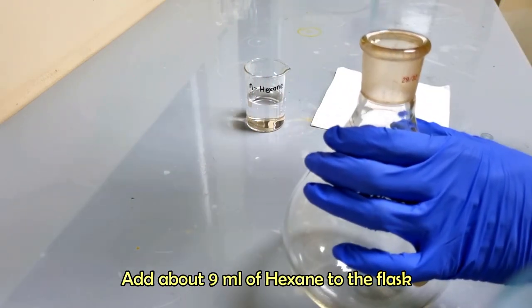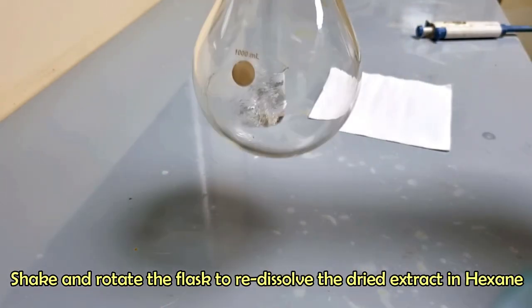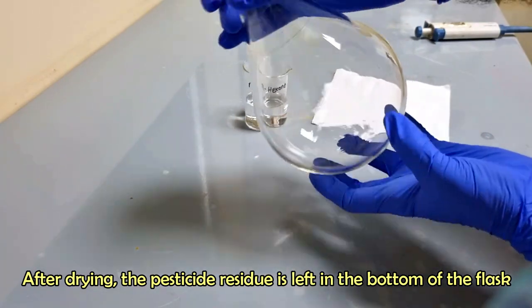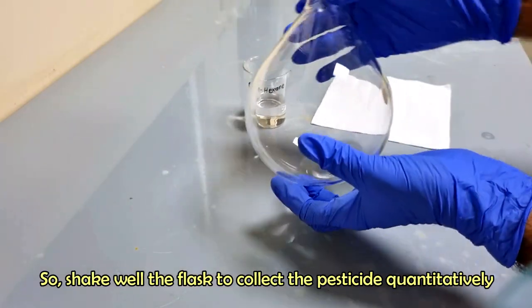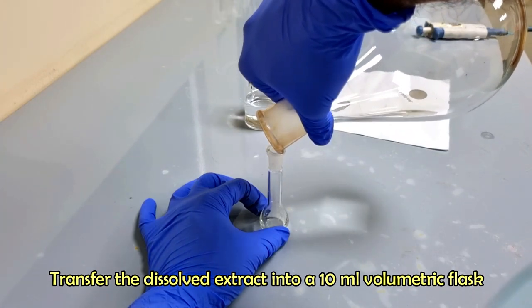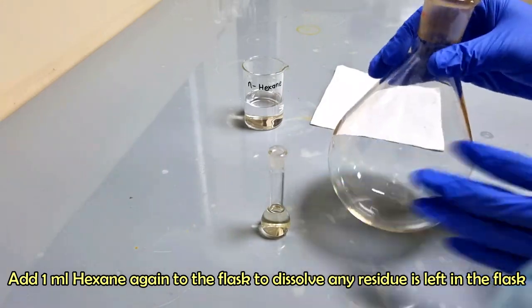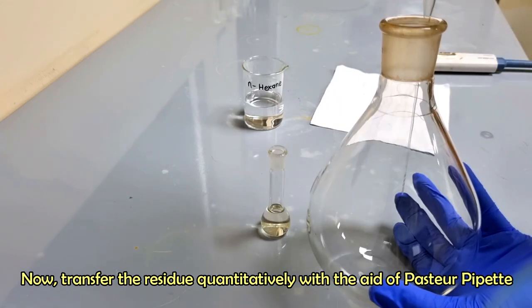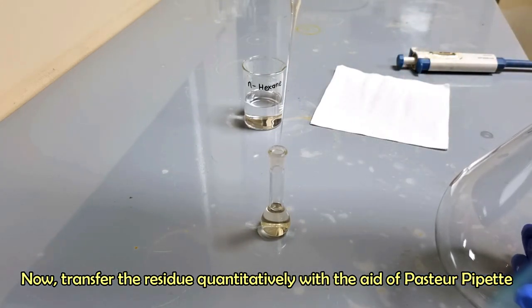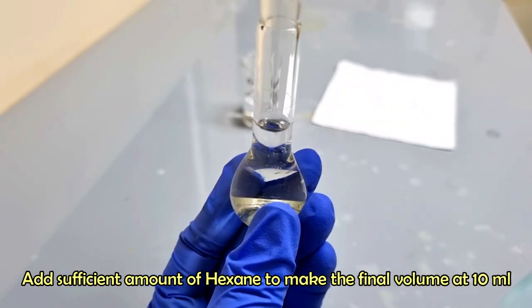Add about 9 ml of hexane to the flask. Shake and rotate the flask to dissolve the dried extract in hexane. It is necessary to shake the flask well for a long time to collect the pesticide quantitatively. Dissolve the residue with hexane and collect into a volumetric flask to make the volume 10 ml. Transfer the dissolved extract into a 10 ml volumetric flask. Make the final extract volume 10 ml.